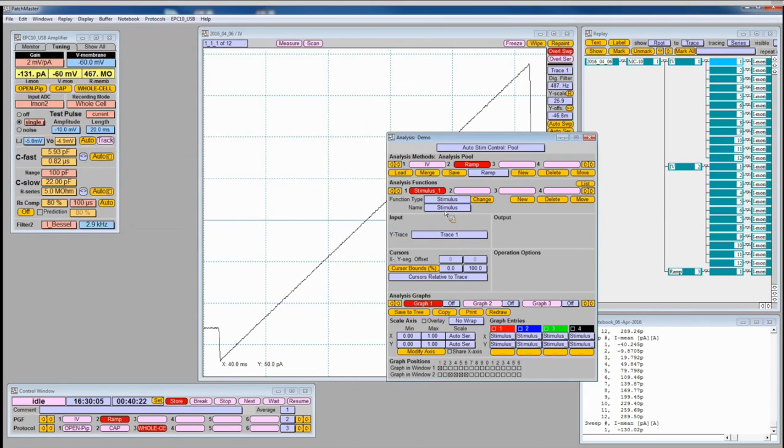Okay. And now we can also, instead of stimulus, give it a different name. We can say this is the voltage, and the whole thing is in millivolts. Okay, this gives us a better idea. When you have many of those functions lined up and there are 5 stimulus, then at some point you don't remember anymore what is what. And so you better give it a nice name that you can remember what it is.